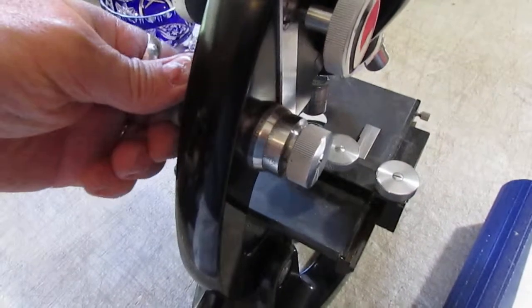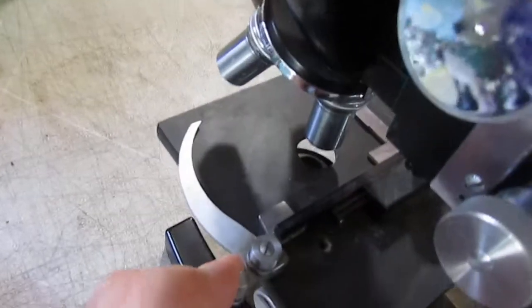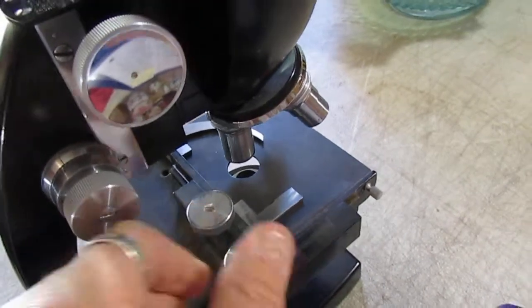The fine-tune elevation adjustment, I believe that's what that is. You've got this slide clamp, I think. And then over here you've got two-way slide adjustment.